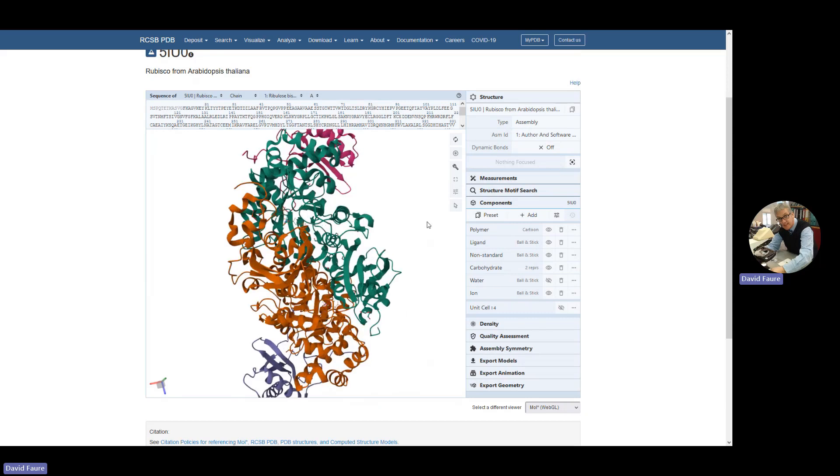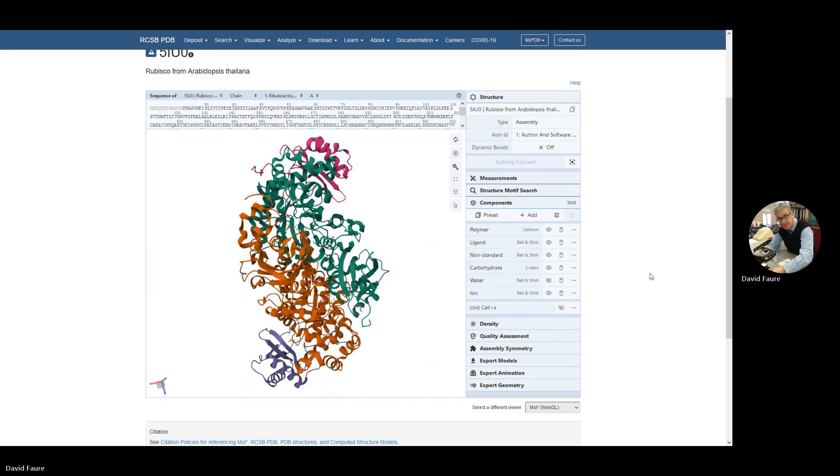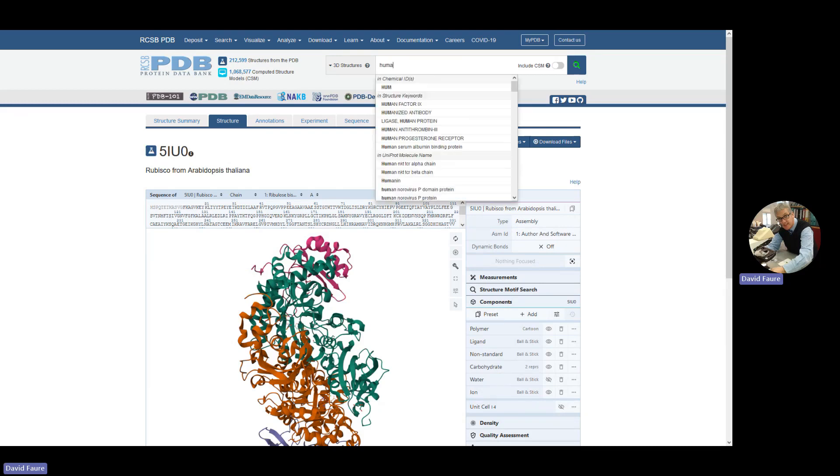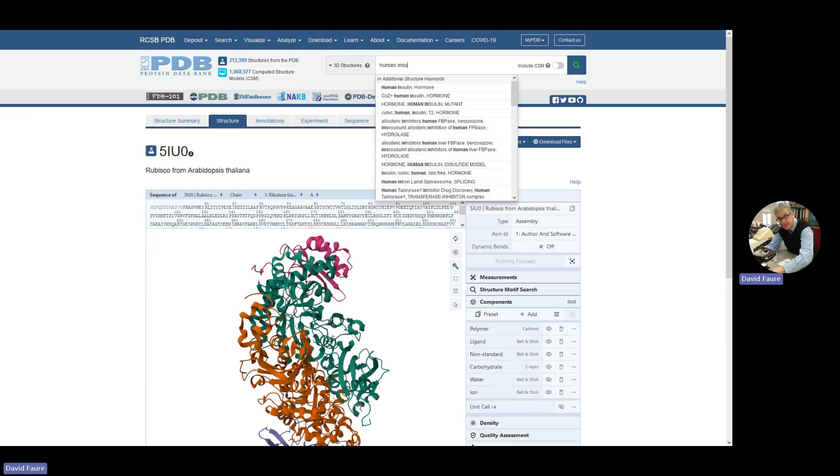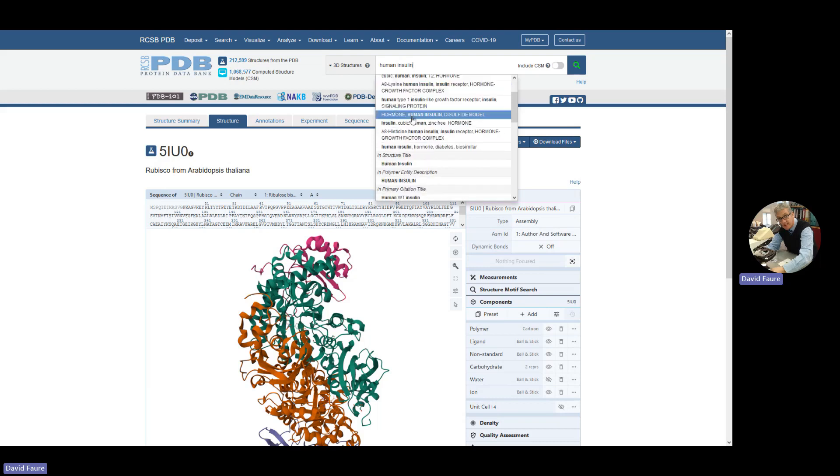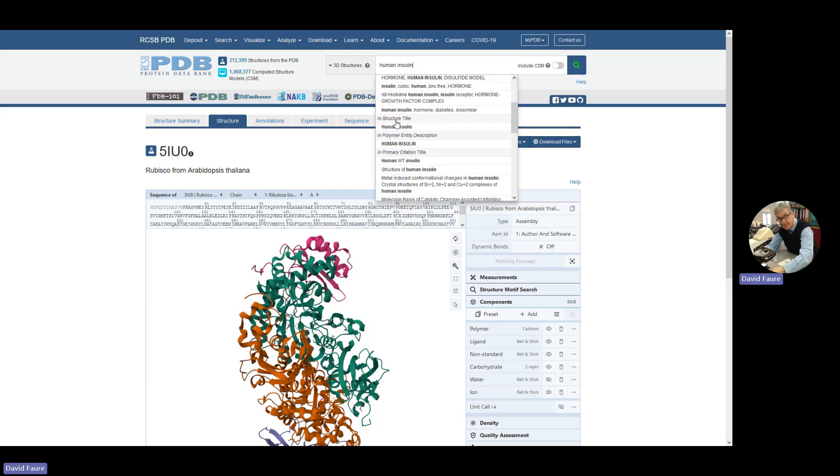So if you want to go somewhere else, go to the search. Let's have a look at human insulin. Careful with the search here in PDB. The beginning of the search gives you all sorts of structure keywords, but it's much better to use the structure title to do your search.